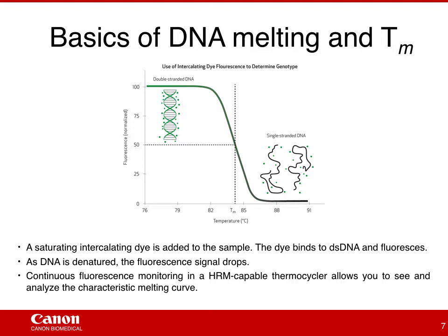At the end of PCR, the fluorescence value is at its highest point. At this stage, the temperature is raised at a linear rate to denature the double-stranded DNA, and all the while the fluorescence decay is monitored by the optics inside the thermocycler. Each possible copy number yields different fluorescence signatures during the melting and are therefore able to be separated from one another during data analysis.